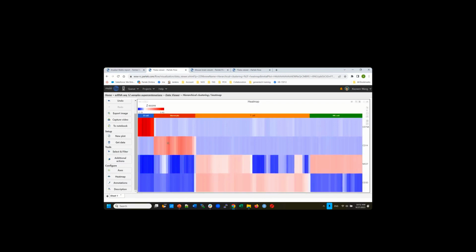And if your genes are really marker genes, I think this heat map is really compelling. For example, CD79A, I can clearly see this is a marker gene for these cells. Every vertical column is a cell, and in the group of B cells, they really have high expression. And this one is CD14, and then this is NK, and NK marker genes probably are not that great. I can clearly see this NKG7 has a high expression also in T cells, which kind of makes sense, right? And CD3D is highly expressed in T cells.